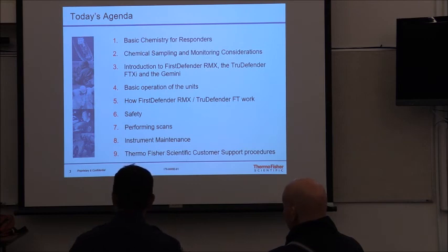It's all good. So I'll talk about some real basic chemistry, and I do mean real basic chemistry, just because both technologies need one thing in order to get hit, and if they don't have that in a chemical, they can't see the chemical, and that one thing is a covalent bond. So if we go back to basic chemistry, if something is purely ionic, table salt, neither device can see it.